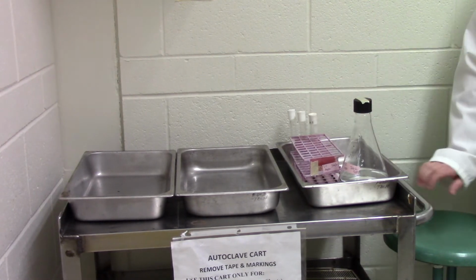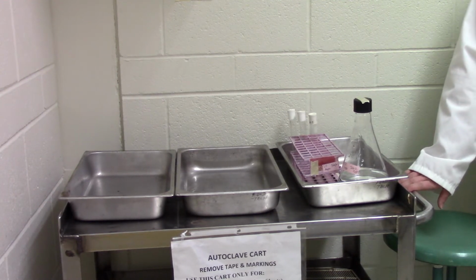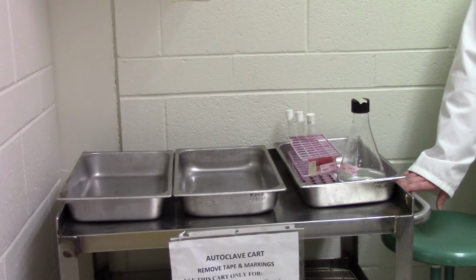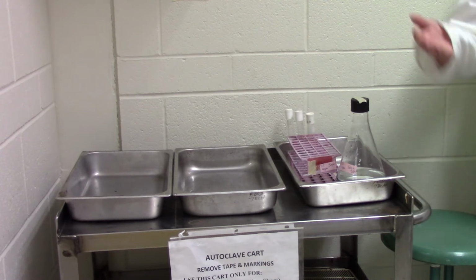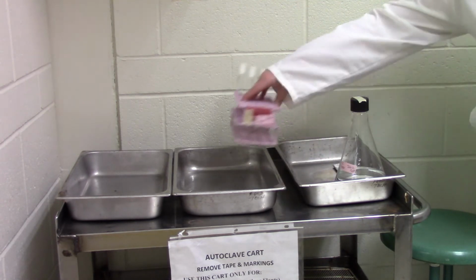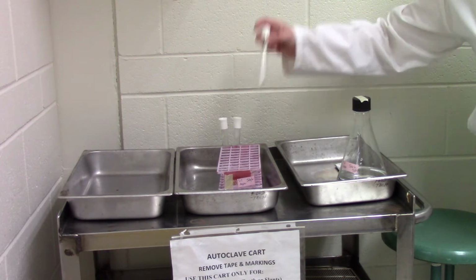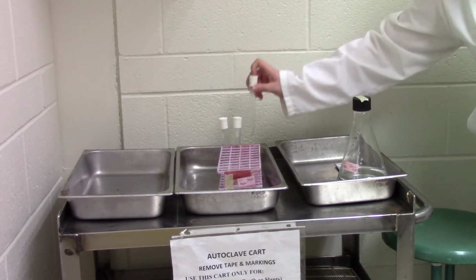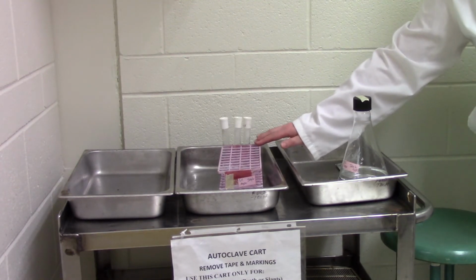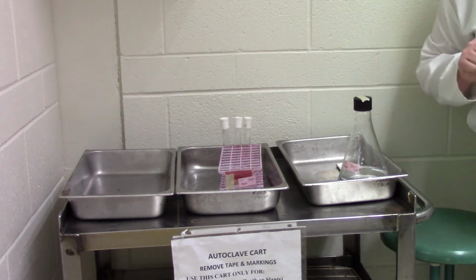This is also going to be the spot where you put any used tubes that have had bacteria on them or that could potentially be contaminated with bacteria. So at the end of your labs, you'll be bringing any potentially contaminated glassware back here, and usually we'll have just a test tube rack like this one set up. And just load in your tubes, make sure they don't have labels on them anymore, load them in, and make sure that this time, instead of spacing them out, we're going to put your tubes close together so that we can get as many of your tubes through the cycle in one go.